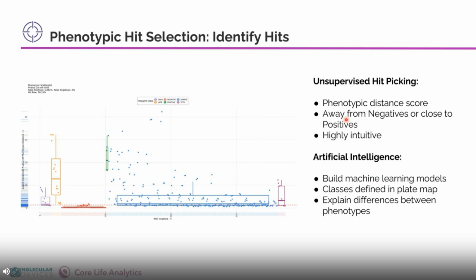Moreover, I won't go into too much detail here, but an attractive thing about high-content screening and imaging is that it's very amenable to machine learning and the use of artificial intelligence. And this is already being implemented in StratoMineR to recognize phenotypes of interest.